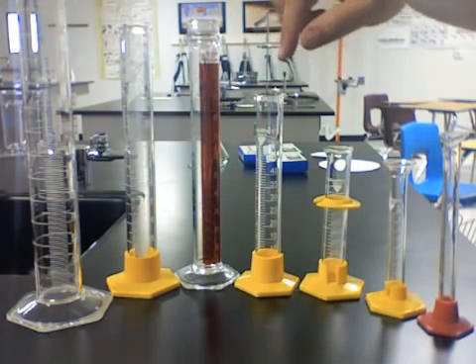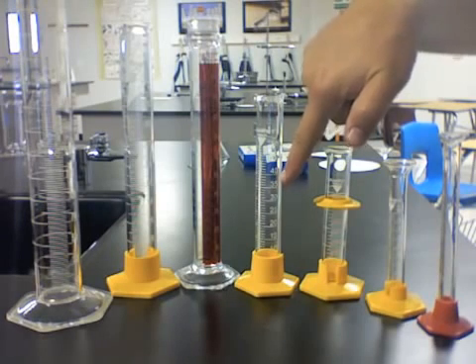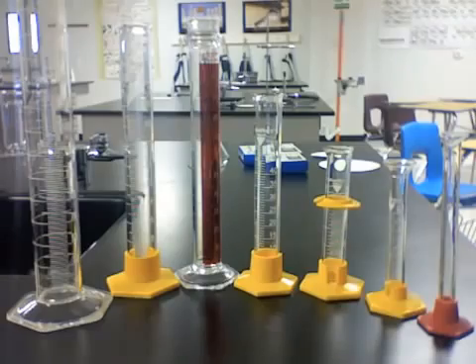It would be better to measure out 35 milliliters with a graduated cylinder than it would be with a beaker, because there are more lines on the graduated cylinder.